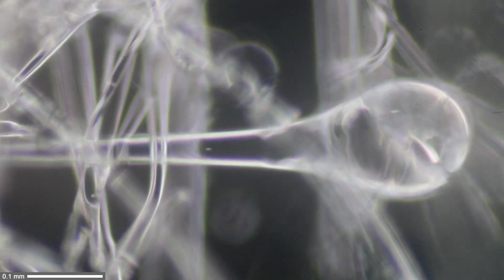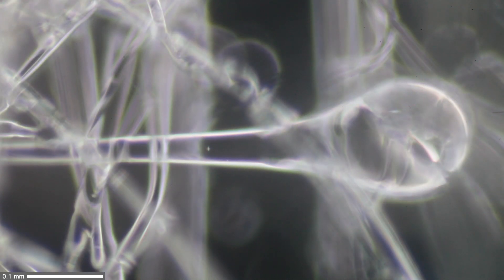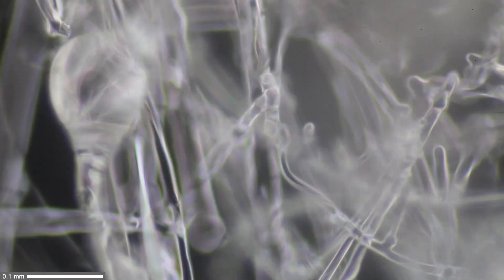At higher magnification, that's the 20x magnifying objective, the total magnification is much higher and the depth of field is unfortunately even lower, but that's just the way it is.